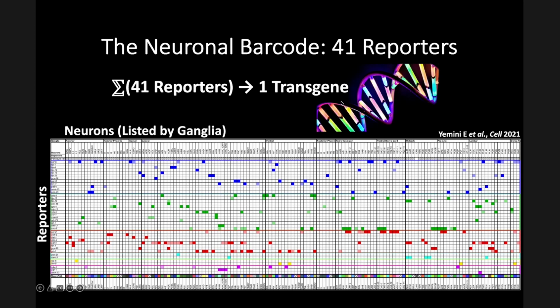And it turns out that this technique is robust. I don't know why, part of science always is luck. But the key thing here is that every time I injected this cocktail, I got worms that had exactly this coloring, as you see here. And ultimately, what I did is, these transgenes are extrachromosomal, right? So they just float around and they're lost eventually as a result. But we gamma irradiate the worms.